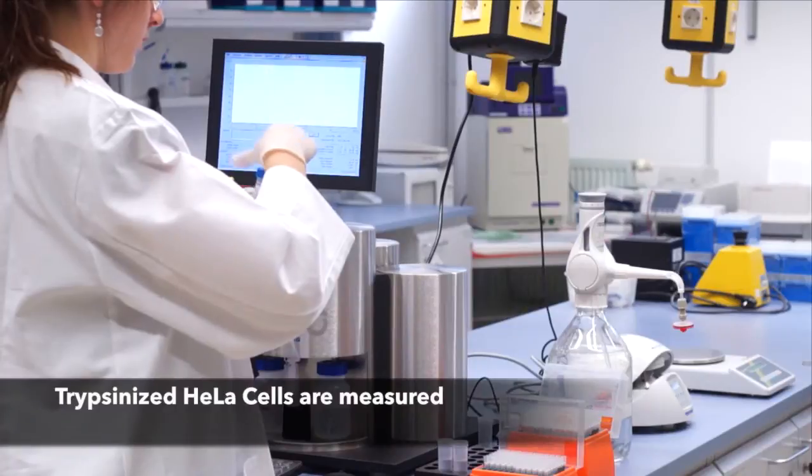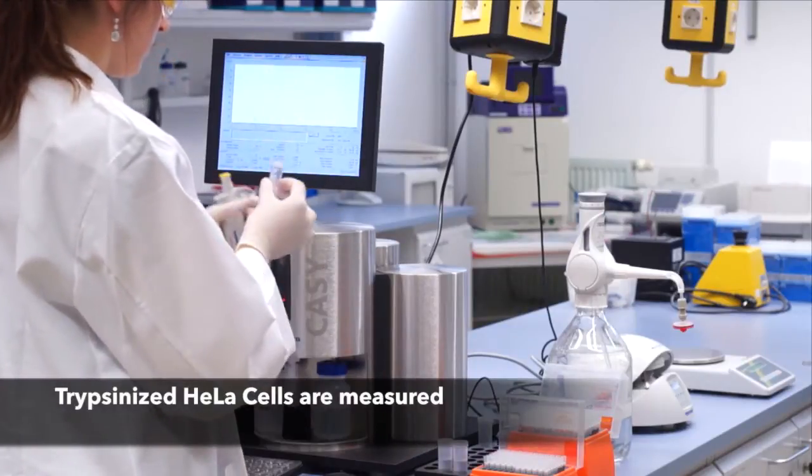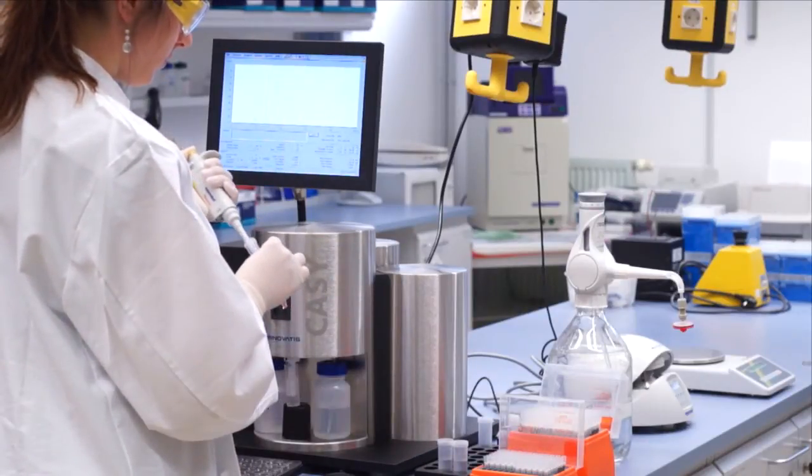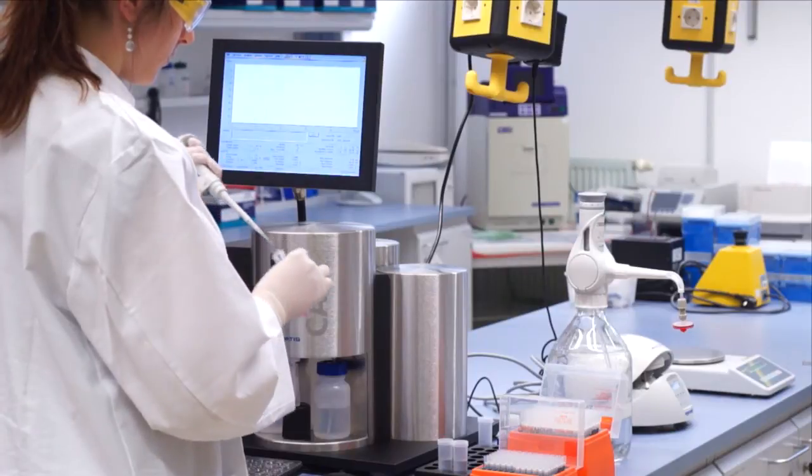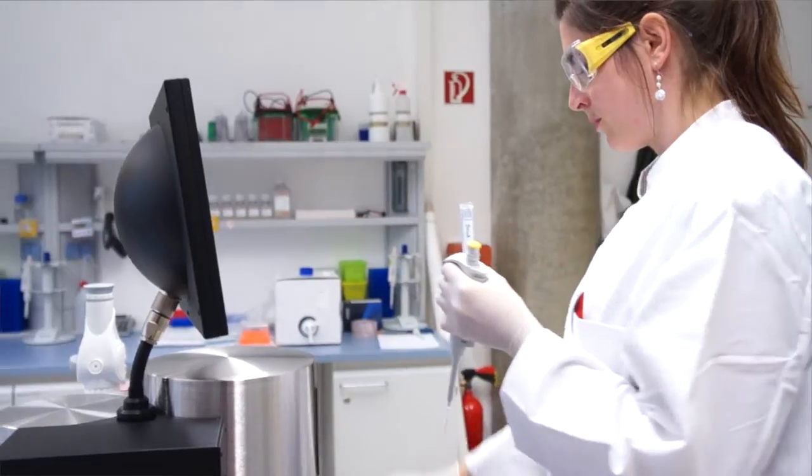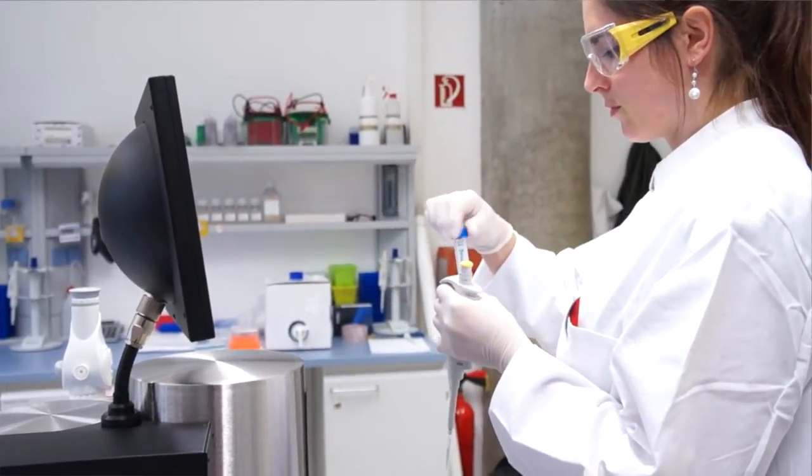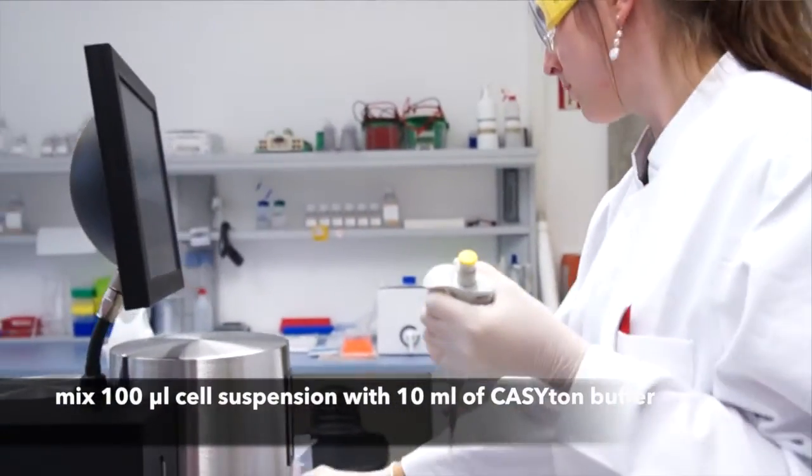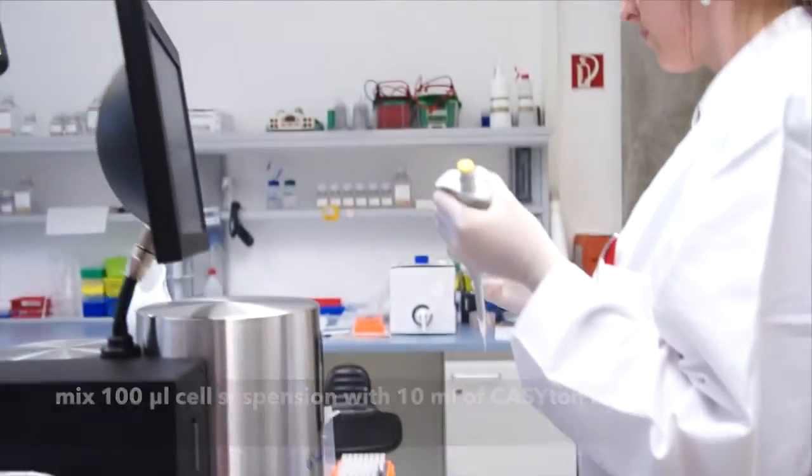We will now perform a measurement of HeLa cells. The instrument has already been set to measure these cells. We pipette 100 microliters of the sample and mix these 100 microliters with 10 milliliters of measurement buffer KC Tom.